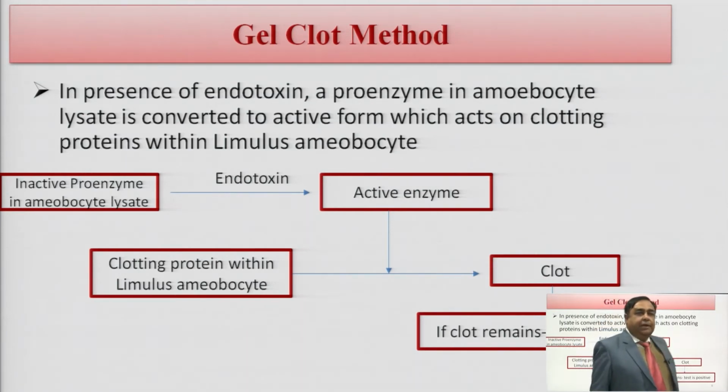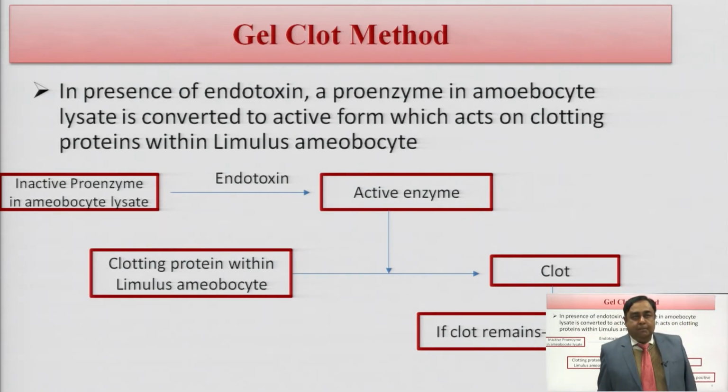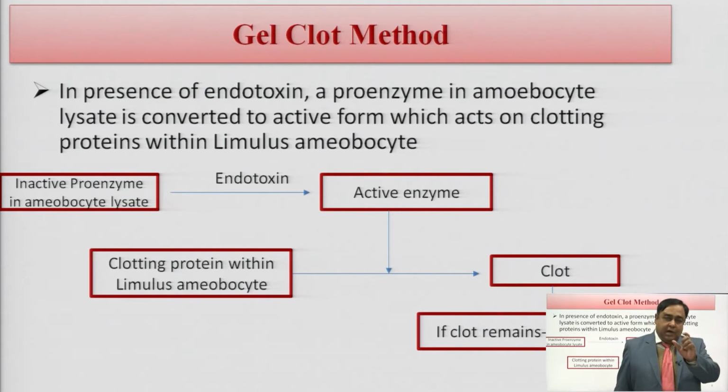In the first method, which we are calling the gel clot method, the term gives you an idea of the process. The process goes like this.